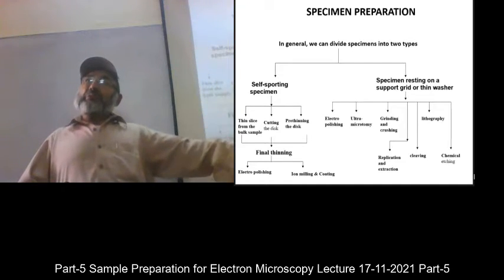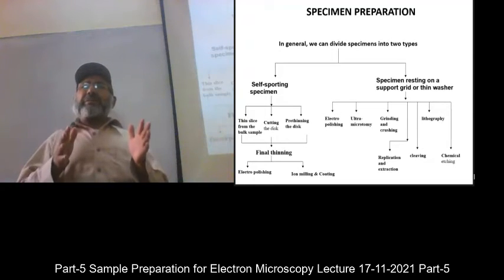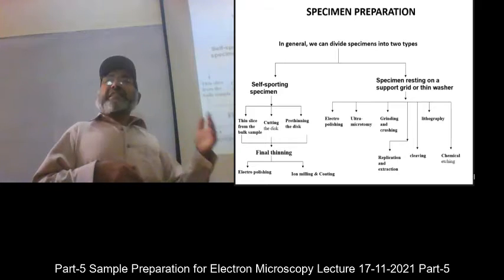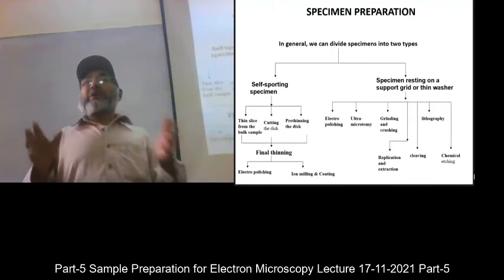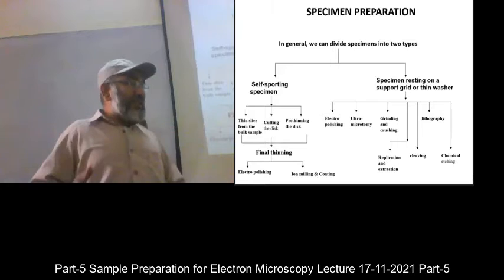And again, when you describe those results, you don't say that this material contains these phases or the chemical composition is this. No, you carefully say that I selected samples from here, here, and here. And the microscope told me this, and that for each sample.